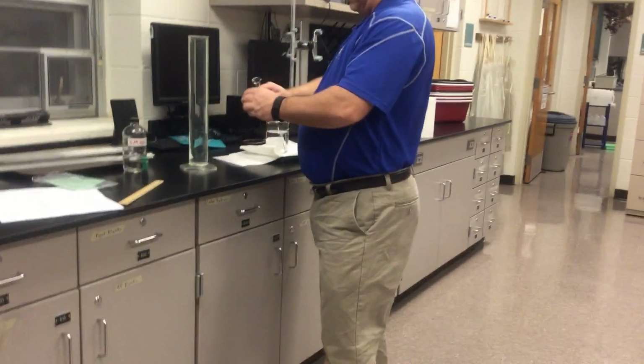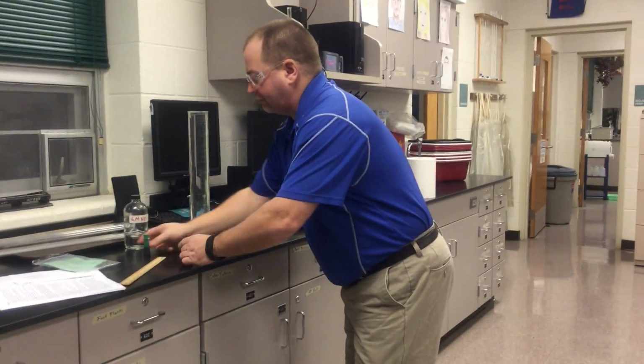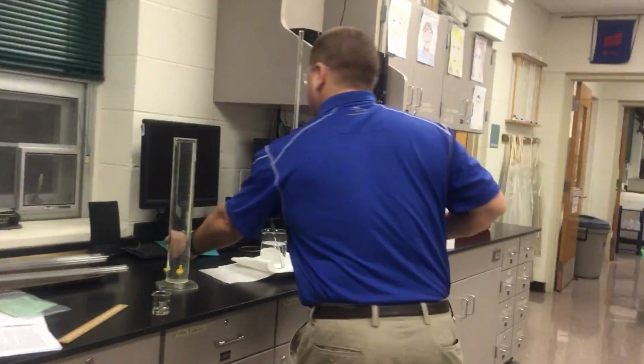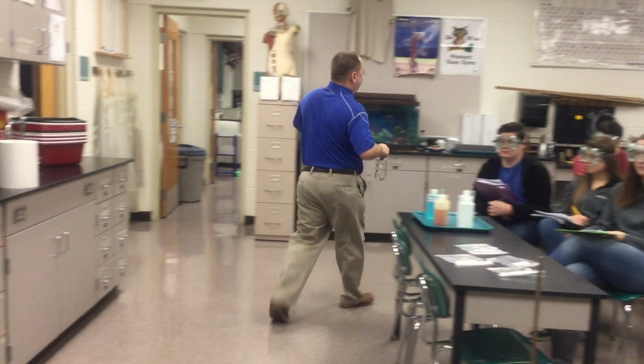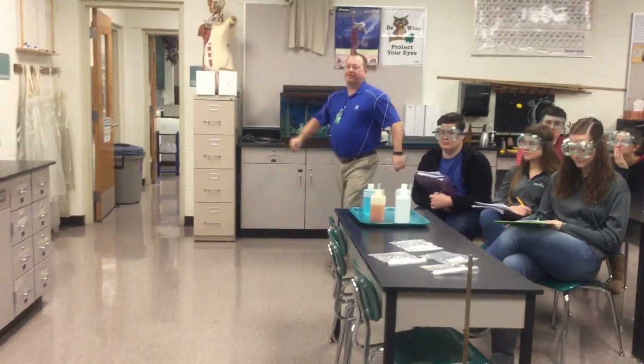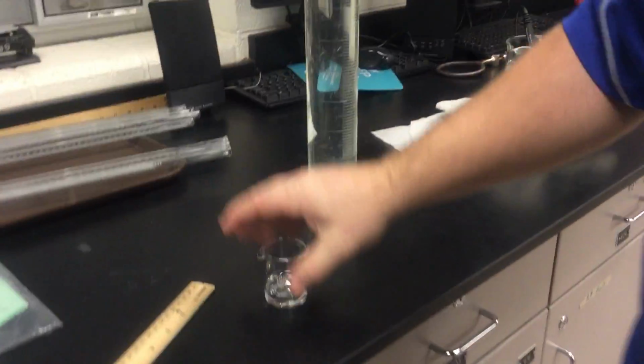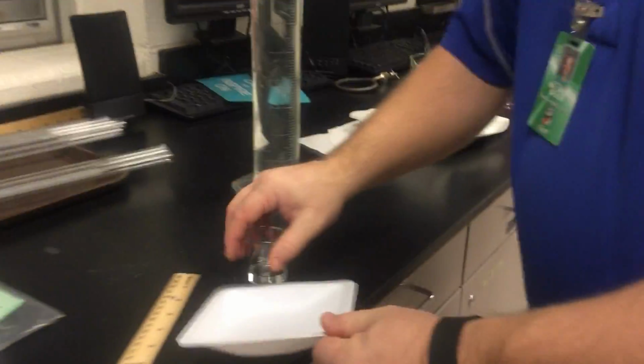Add 3 drops of green food coloring to the acid beaker and note any changes. So, I'm going to put this into my beaker, and I'm going to add 3 drops of green food coloring, and you have to make note of any changes that you see. So Kyle, come in here close so we can get a nice video of this.